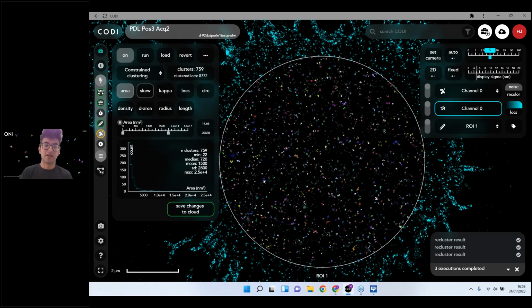Okay, so there's a lot there, but using this type of analysis, we can pick out clustering with DBSCAN, HDBSCAN, and with constraints. And using this type of analysis, which I've done offline before the webinar, we can now revisit the slides and see how that data can be interpreted. Now, just so that you understand what's going on, if we save the results here, we're able to export that. We're just running some operations in the cloud to save these results down for future. Then I can access it over here once that's completed.